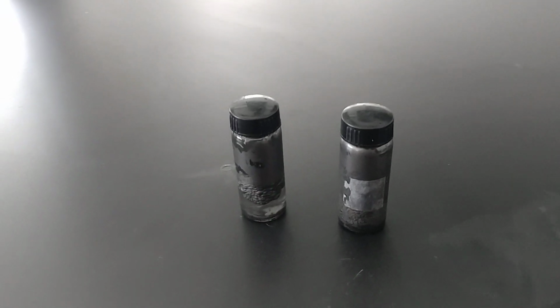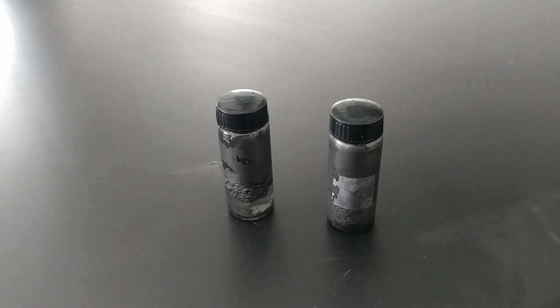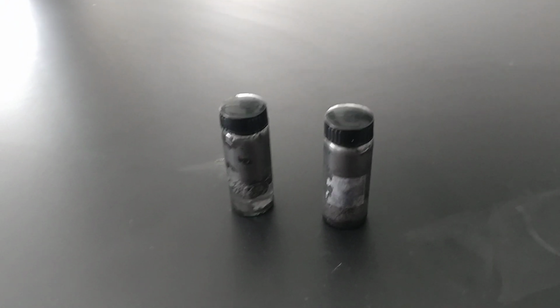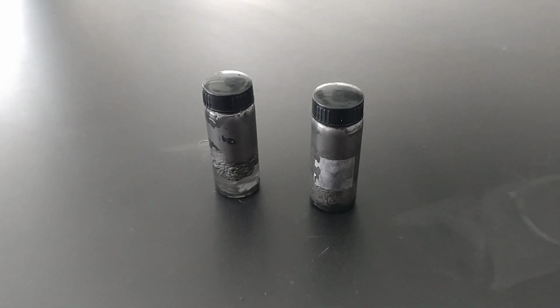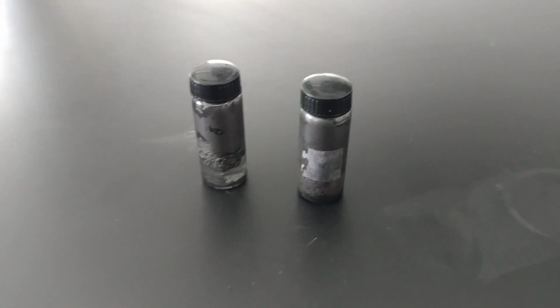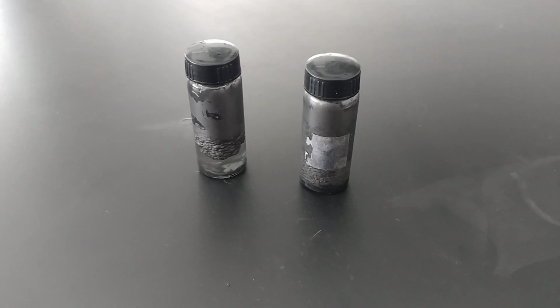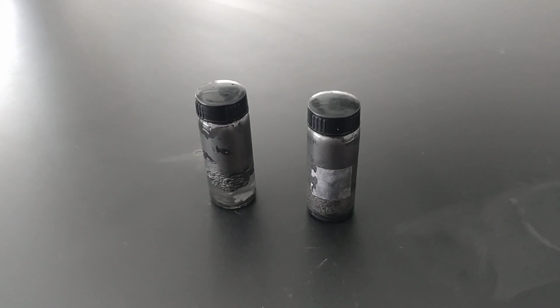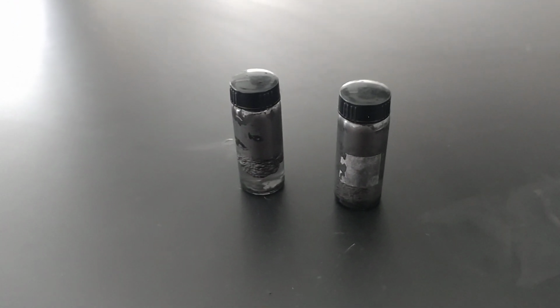There's a lot of you guys out there that ask about how to know if you have graphene, how to test it. Well, I'll tell you, the definitive testing is through an AFM and a TEM. Now, most of us do not have access to a $250,000 AFM, and almost none of us have access to a $1.5 million TEM to be able to definitively tell if we have graphene. Yeah, a lot of people say Raman might work because those machines are cheap, but you can get mixed results. Well, that's the problem. You get mixed results and you don't really know what's going on.